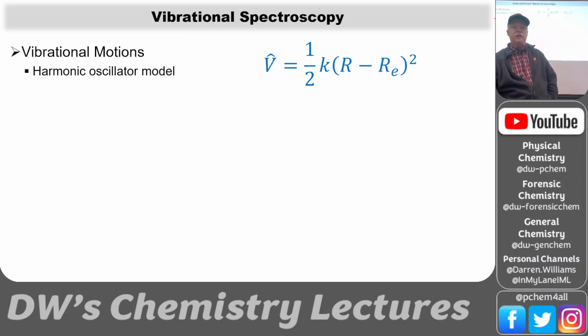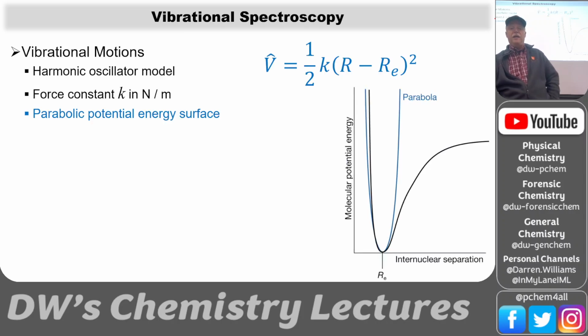potential energy function, and it looks like this. So every one of those vibrations is using this harmonic oscillator potential energy. The deviation from its equilibrium position causes it to rise in energy. Why is that? Well, because it's typically related to the bonds and the angles in the molecule, and those are governed by the electrons. So there is an optimized geometry, and that's what we did in Gaussian. We optimized our geometries. If we move away from that optimized geometry, the energy goes up, and that's this vibrational potential.